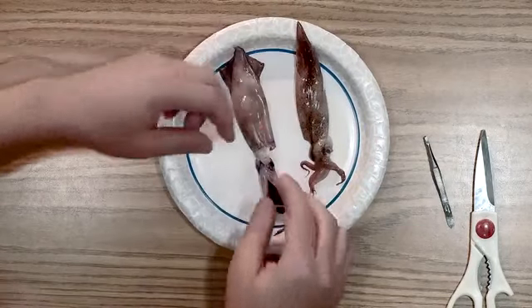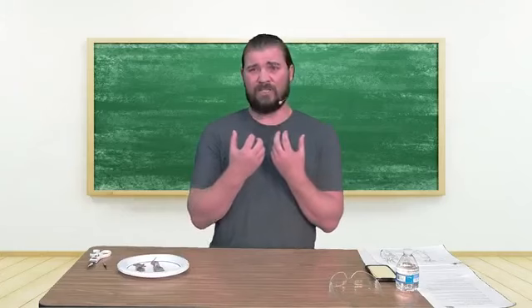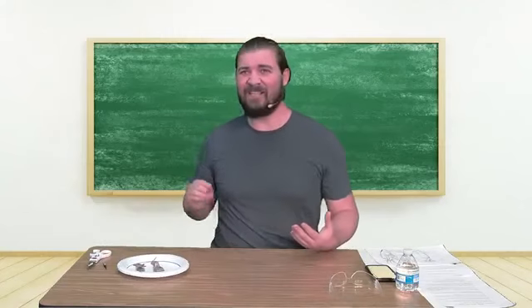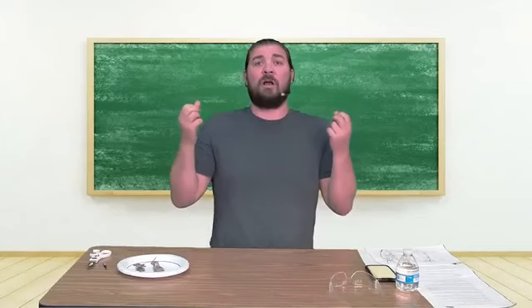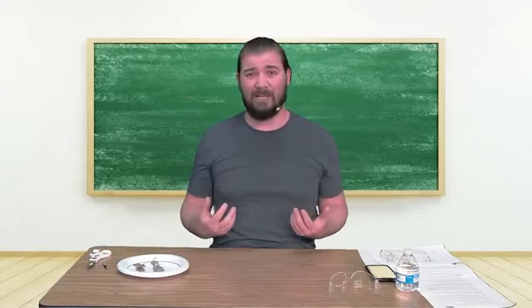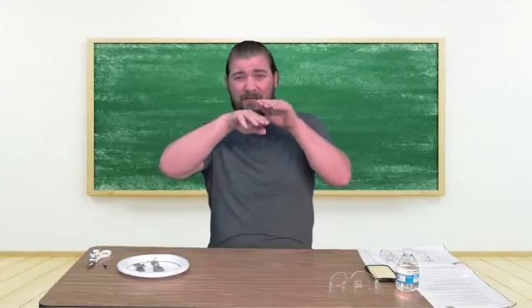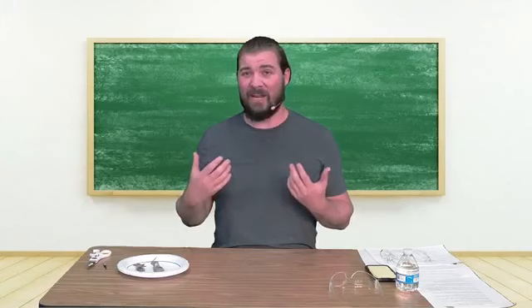The way that the siphon works is the squid will suck water into its body through one part of the siphon and then shoot it out through that hole, almost like it's a jet engine. And this thing will fly through the water with that in little pulses. It'll breathe in, just like we breathe in, and then push it out through that siphon. Except for instead of breathing air, it's breathing in water and pushing it out. When it pushes water out through that siphon, you can even see on video a ripple effect on the bottom of the squid, which is really cool that it moves like that.